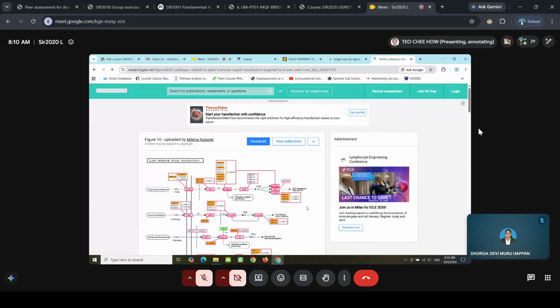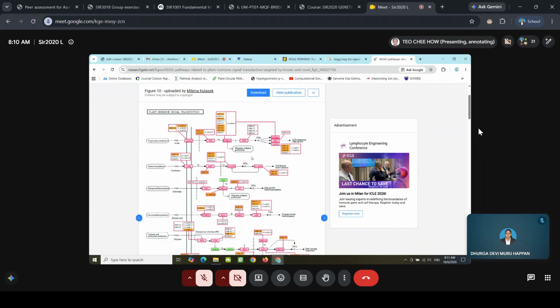Some of the tools available, for example TBtools and others, allow you to analyze GO and KEGG, and allow you to import the data. So import your genes that are involved in this pathway into this pathway, for example. This one is actually manual, but the coloring here, the green and red coloring: red indicates up regulation, green indicates down regulation.